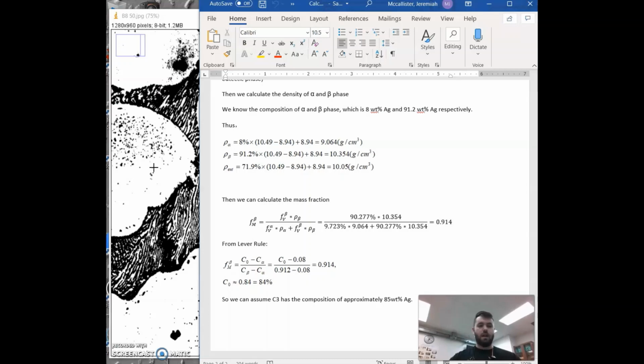You're going to do that for one or two of your samples, I believe, maybe all three. I don't remember, but it's relatively easy to do. And you'll report those calculated compositions on your lab report. And then next week we will see how accurate those compositions were, because we will take your sample into the SEM and do EDS spectroscopy, which gives us chemical analysis of our materials.